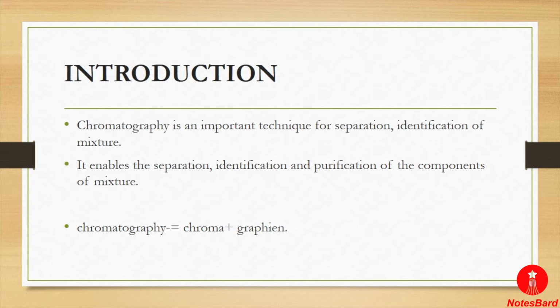At first, the Russian botanist Mikhail Tswett coined the term chromatography in 1906, and Tswett used this technique for the separation of different plant pigments, and that's why it is named chromatography.